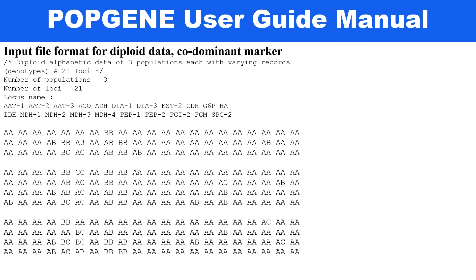For the diploid co-dominant marker data format, similarly the first line is the title, followed by the number of populations (three here), number of loci (21 loci in column-wise format), and the data is in alphabetic format. Genotype is not required in this analysis — just your data and locus ID are needed. Arrange your data in Excel in this way and paste it into the Popgene text editor, then save your data types.